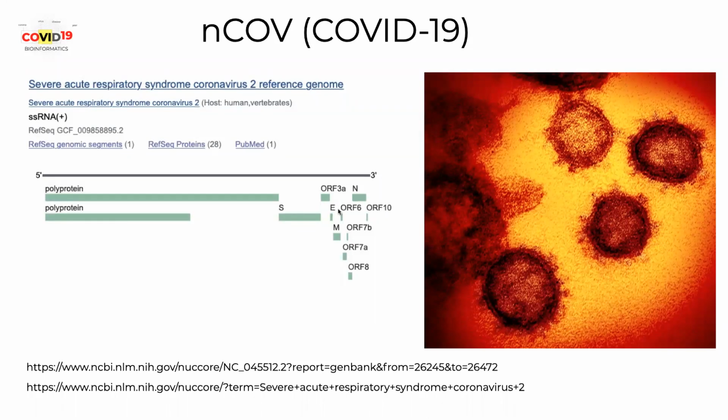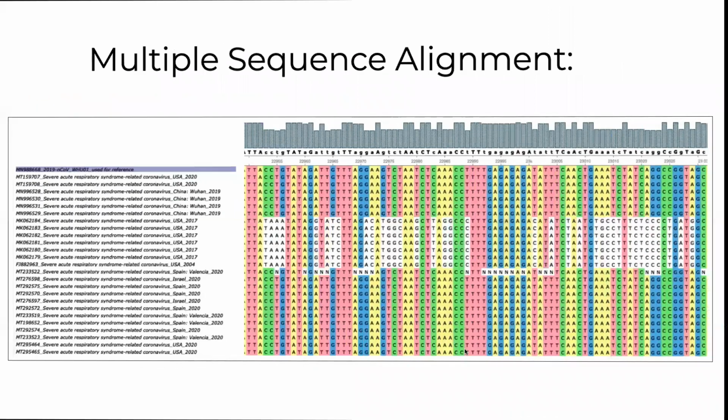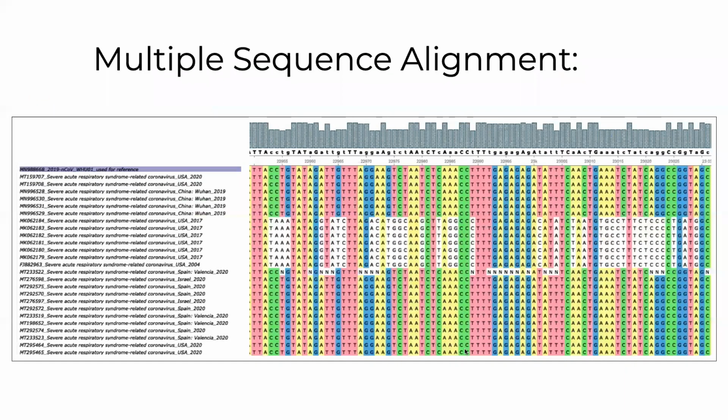What is that? Here's a multiple sequence alignment. Please take a look at this and tell me, what do you think we are aligning, and what are the differences that could be seen? Please put your answers in the chat.